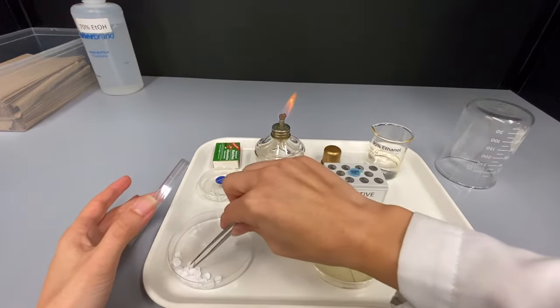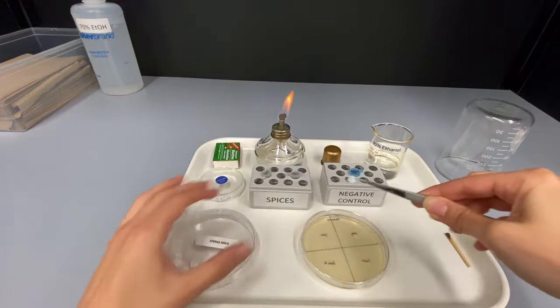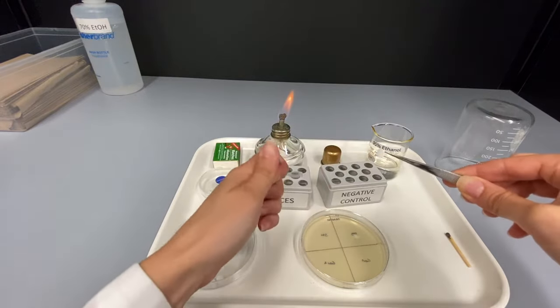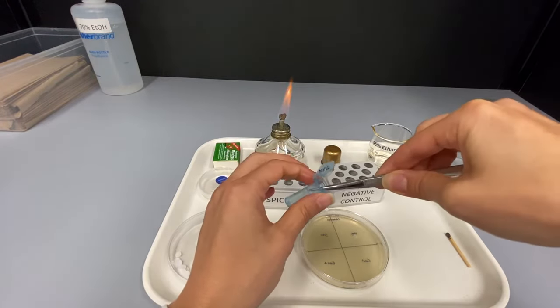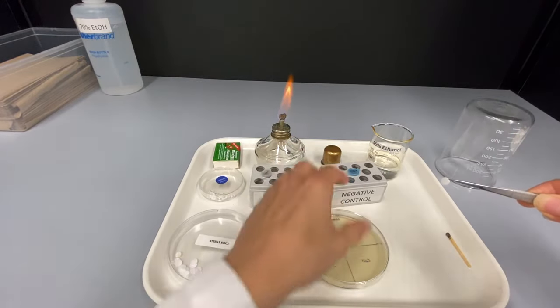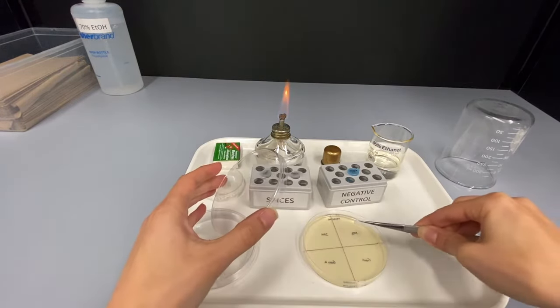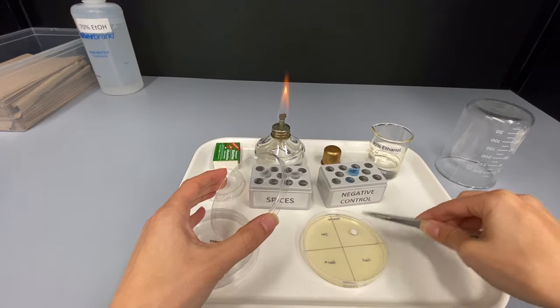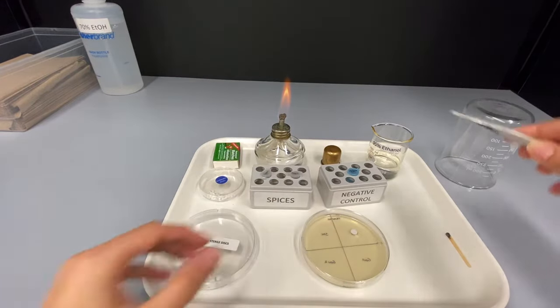Pick up a blank disc with the forceps and hold it in the sterile water, leaving it for approximately 10 seconds. This will be your negative control disc. Lift the lid of your plate, place the disc in the center of the negative control section of your plate and then close the lid.